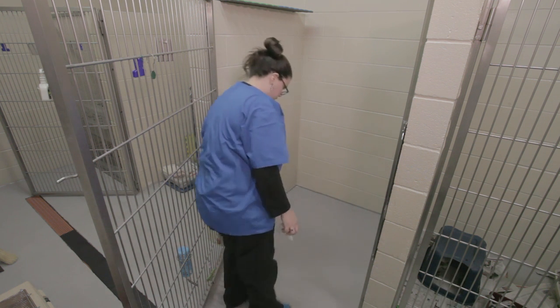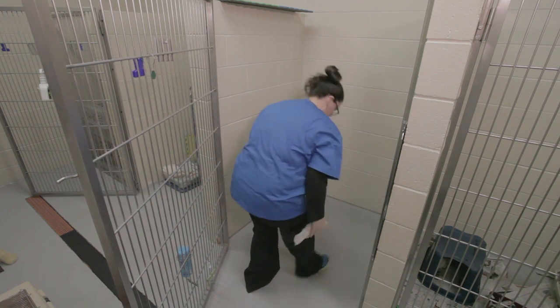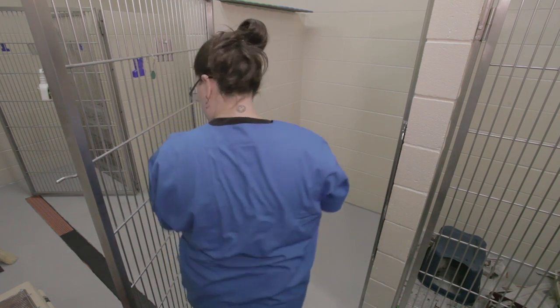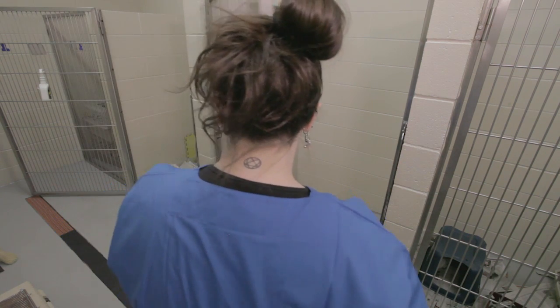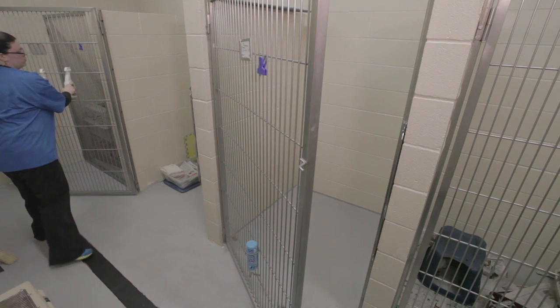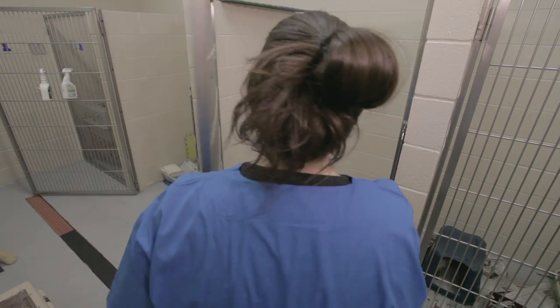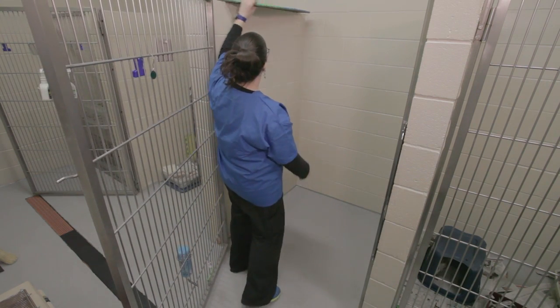I think that looks like a solid. There we go. And then we'll put the mat down, which is more for warmth and separation from the floor.